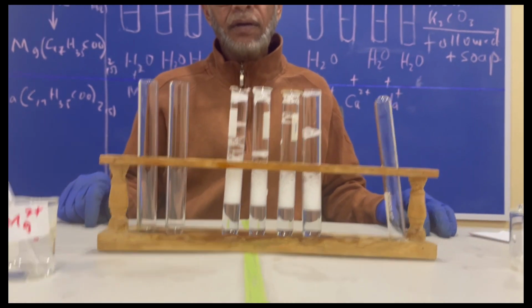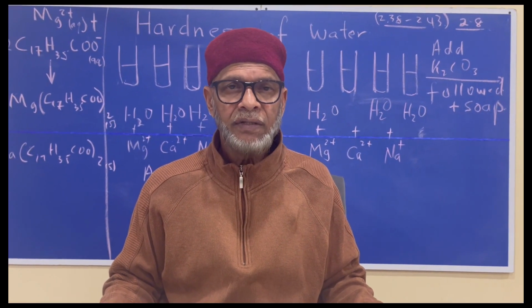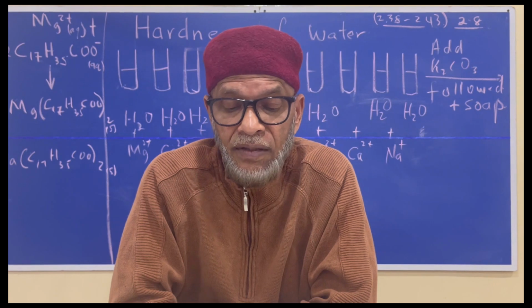That is it for now. We've shown you the causes of hard water, how hard water can be softened. We show you how detergent is not affected by hard water, okay?